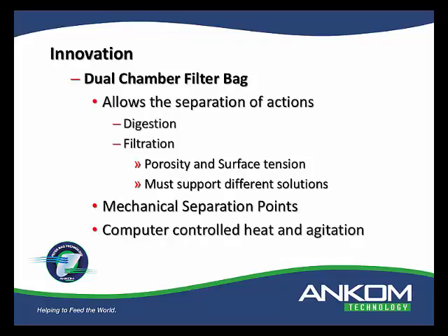You have to remember that by method, the Gooch crucible has a porosity of 40 to 60 microns, and that porosity is made finer by the use of diatomaceous earth. That's why the creation of the diatomaceous earth bed in the crucible is so important, and quite frankly, how it's handled throughout its process. If that diatomaceous earth is disrupted significantly, it is going to affect the filtration matrix.